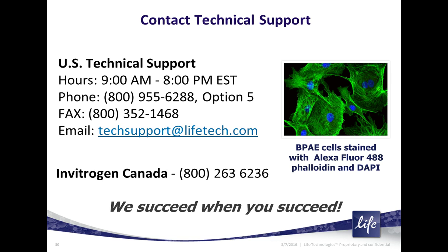Now, going on more about that question about the direct conjugates being dimmer and a little harder to penetrate into tissues, certainly, but sometimes cells too. Direct conjugates often aren't used if it's a dim or low-expressing antigen. For tissue, the autofluorescence is often strong enough to overwhelm your dimly labeled direct conjugate primary.